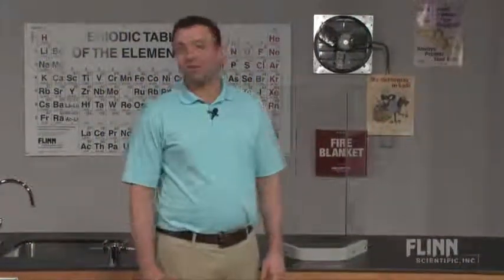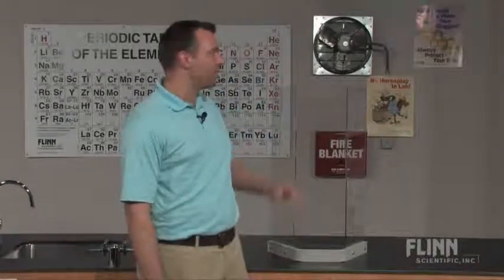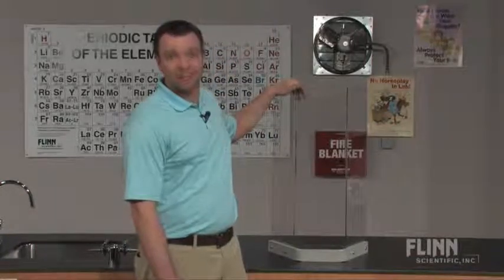Are we gonna blow anything up today? How often do you hear that question in your classroom? Well, your answer should always be yes — of course we are. But when it comes time to present demonstrations that involve combustion or pressure, you always want to make sure you have a safety shield in place. The Flinn Scientific safety shield is the solution.